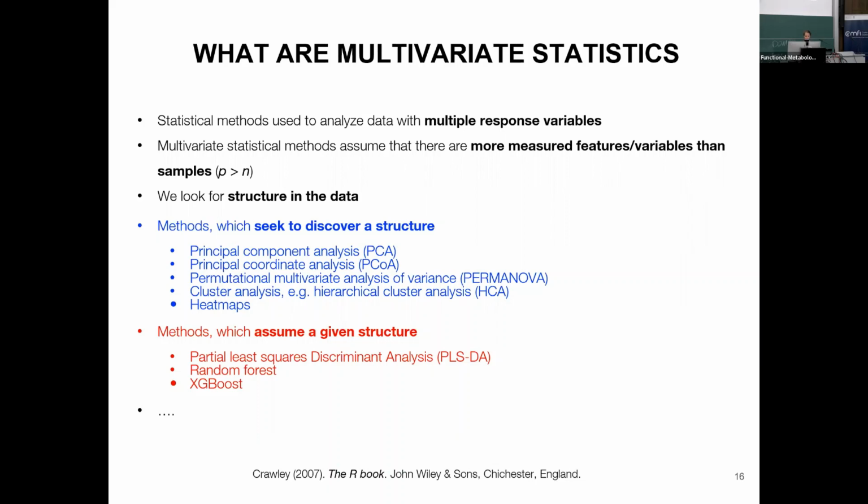We are just showing an example, so there might be many different ways to do things. There is not very much of a standard yet in the metabolomics community. So I think the most important thing is that whatever you do during data cleanup, normalization, and also statistical analysis, you describe very accurately in your methods section what you have done, so future researchers and yourself can refer to it as well.